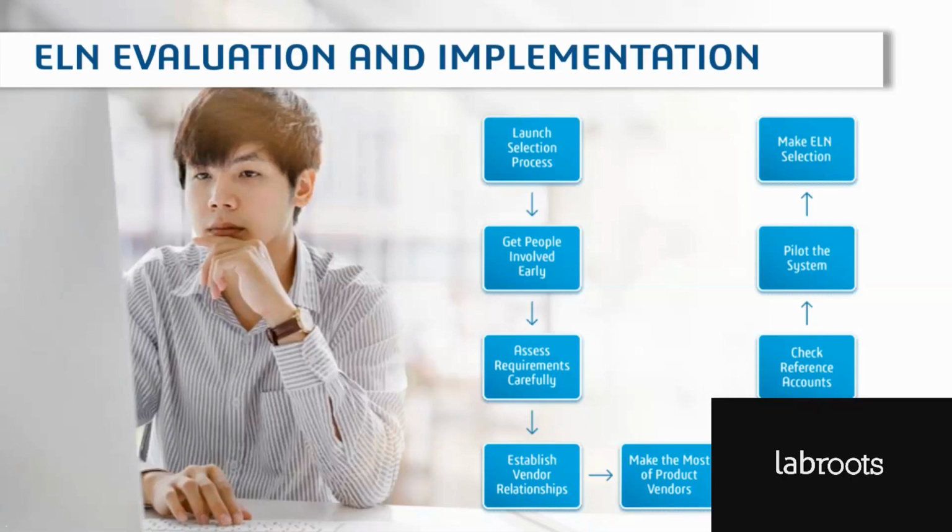And then I think it's also a great idea to try and pilot the system. If you can do that in a small focused lab in an actual production environment, that's a great idea as well, because then you actually have the ability to see how it works in the real world environment, and make sure that your key personnel are involved in testing that system. Be prepared for feedback and to identify key metrics where possible to help measure the value and success.